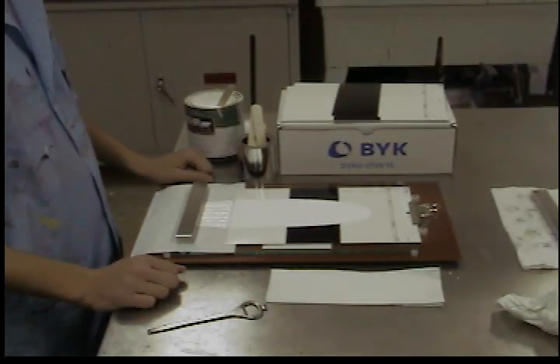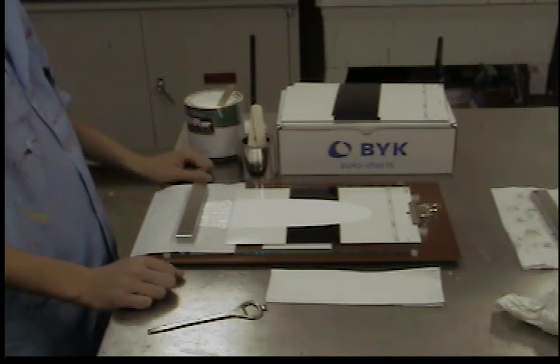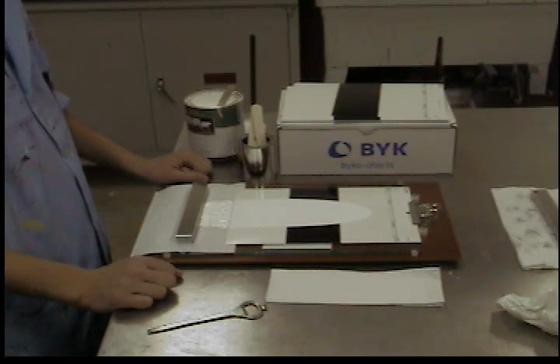The speed of the drawdown, combined with the rheology of the paint, will determine the actual mil thickness of paint that is applied. At this point, you can check the actual wet film thickness with an intermat gauge or a comb gauge. Allow the coating to dry thoroughly before measuring color, gloss, or opacity.